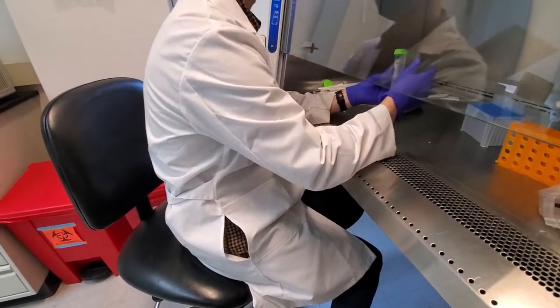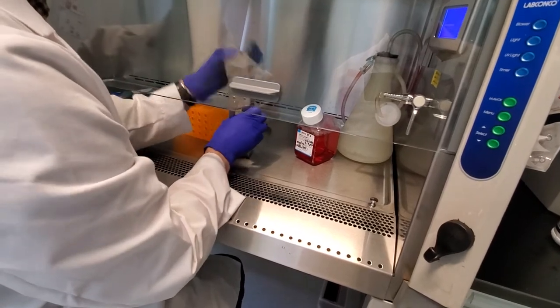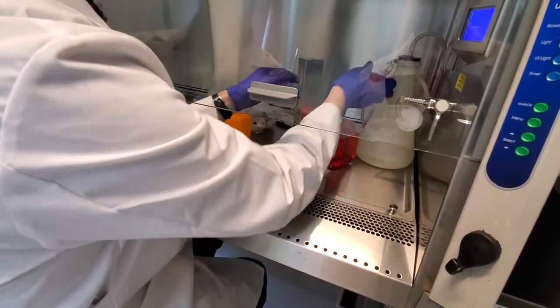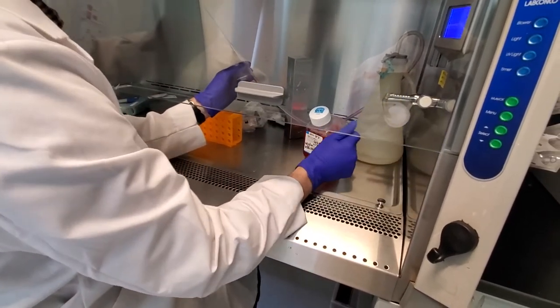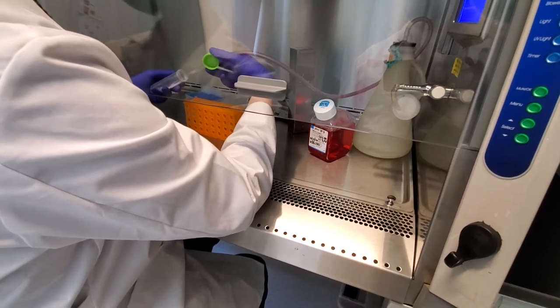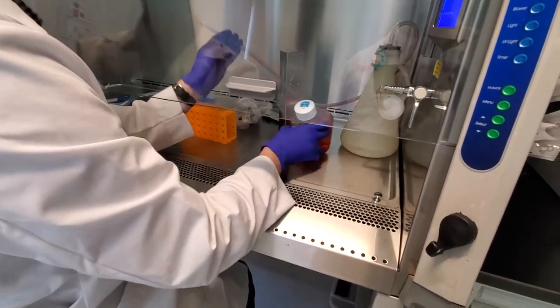There's a little bit of media left in here. So for getting rid of biohazardous liquids, I'm going to go in and get a glass pipette. In the other hood, it's a knob that you turn. That just puts liquid into the biohazard bin. Just make sure you turn this off when you're done using it.